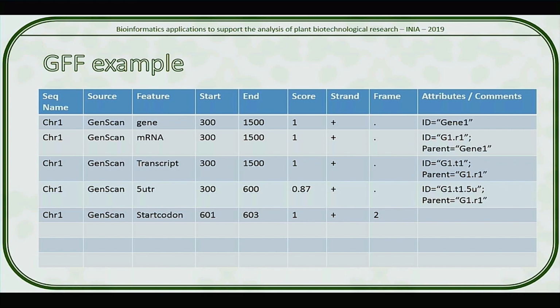It's only meant to be used for coding sequences, which would be start codons and also CDSs. CDS stands for coding sequence. This is the part of the gene that actually gives you the instructions to build a protein.